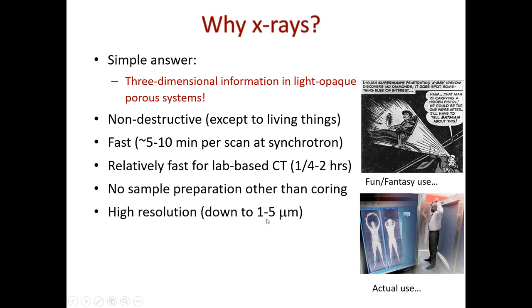There are so-called nano CTs. They go below 1 micron. Again, our bigger problem is the sample size. Now, imagine you're a researcher and you want to know something about the fluid movement in a core that is less than a millimeter in size. What do you do? First things first, you lose your sample because it's too small to see, right?